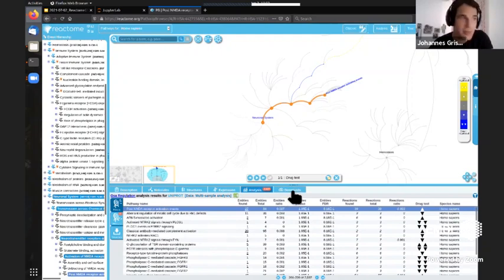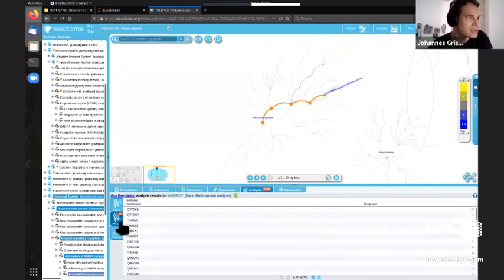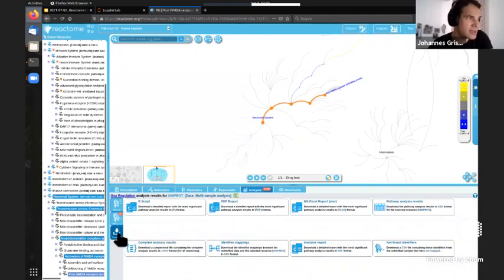Now the reports, you have two download buttons, and don't get them confused. The one I'm talking about is here on the left. You have these three buttons: the results, identifiers that were not found, so stuff that I submitted that is not annotated in Reactome, and then the download section. I'm talking about the download section. And here you have the reports that you saw before: the R script, the PDF report, and the Microsoft Excel report.